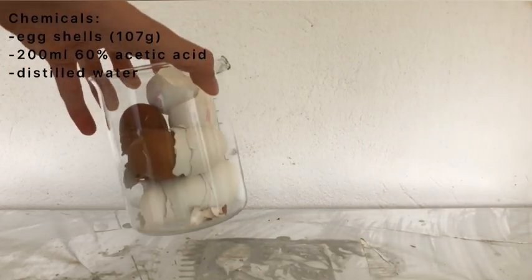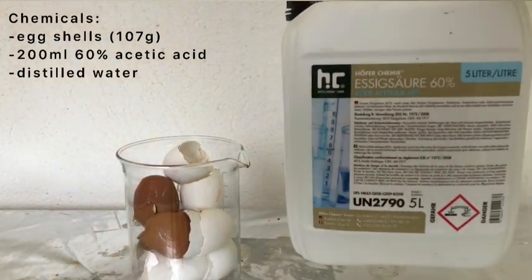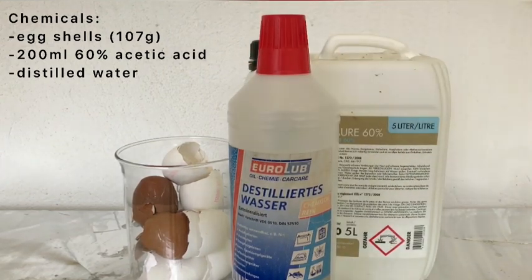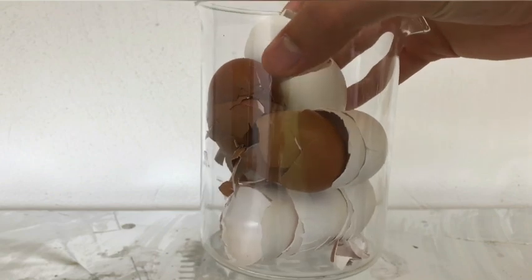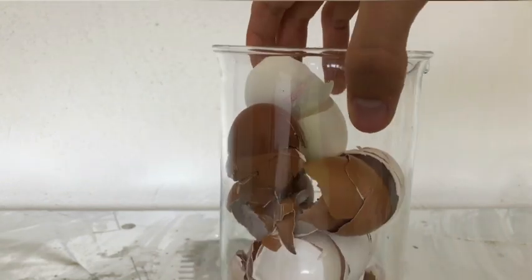Welcome back everyone. Today we are going to make calcium acetate. For this you will need 107 grams of eggshells, 200 milliliters of 60% acetic acid and some distilled water. Eggshells are mostly made of calcium carbonate and therefore they will react with acetic acid to form calcium acetate.